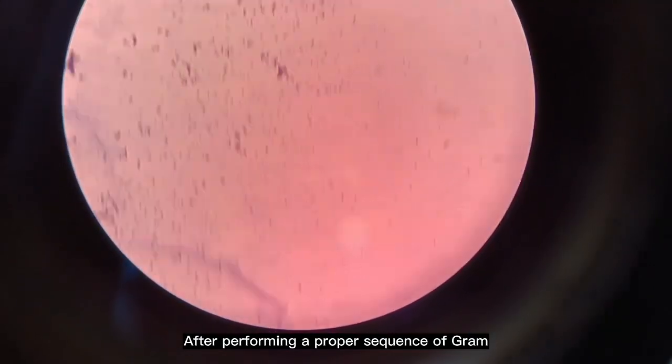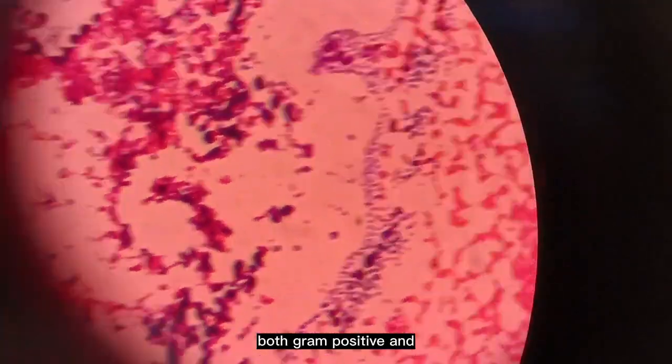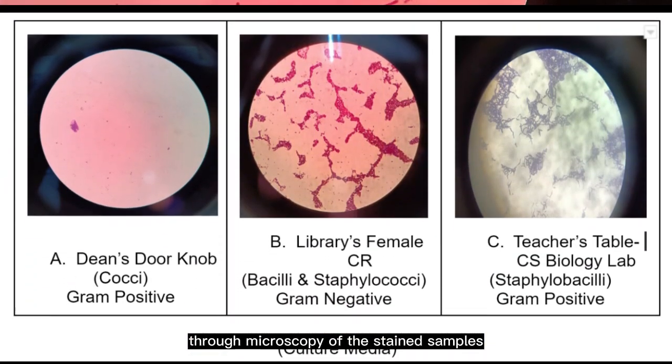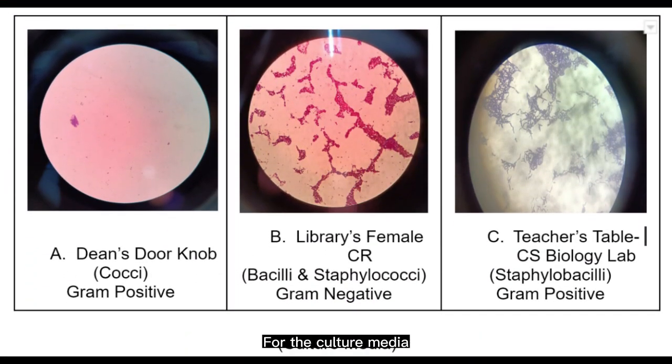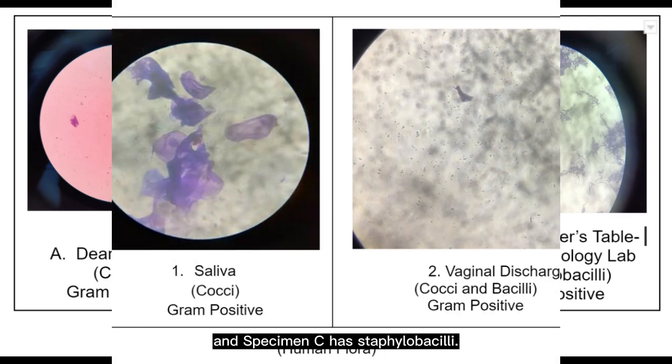After performing a proper sequence of Gram staining procedures with cultured and human body samples, both Gram-positive and Gram-negative bacteria were observed through microscopy of the stained samples. For the culture media, both specimens A and C, which were from the CS Dean's Doorknob and CS Biology Laboratory Teacher's Table, contain Gram-positive bacteria, while specimen B from the library's female CR contains Gram-negative. Specimen A has cocci, specimen B has both bacilli and staphylococci, and specimen C has staphylobacilli.